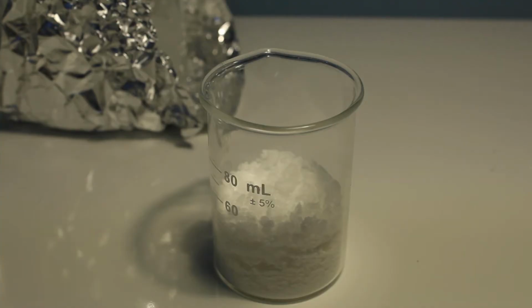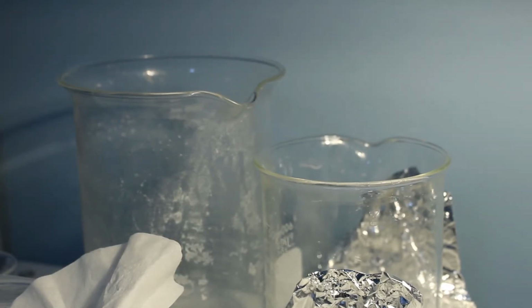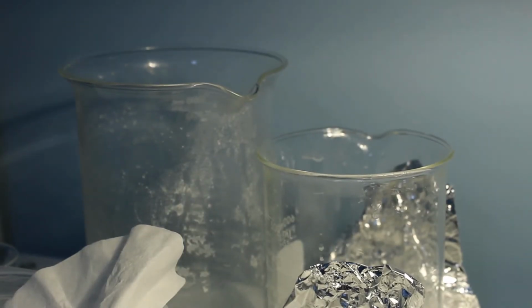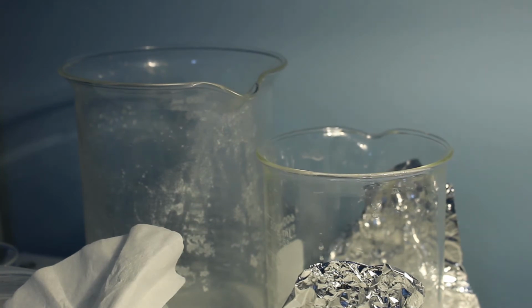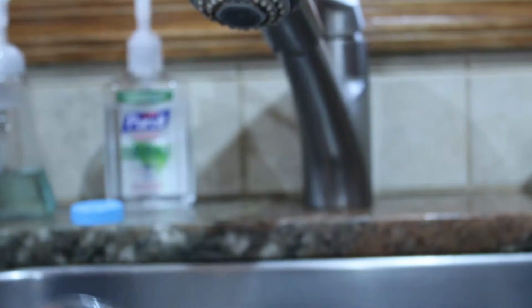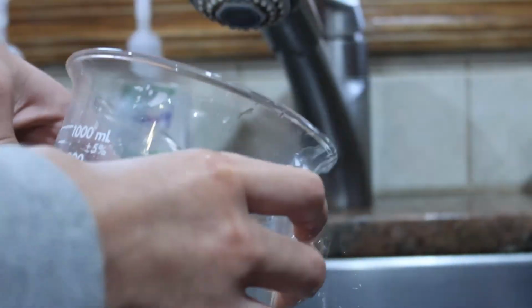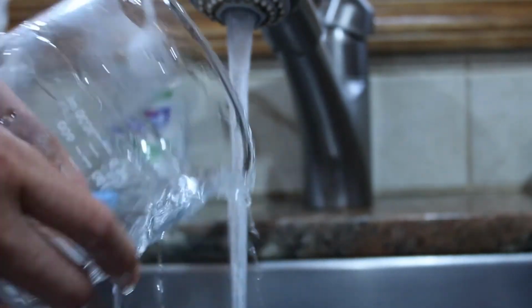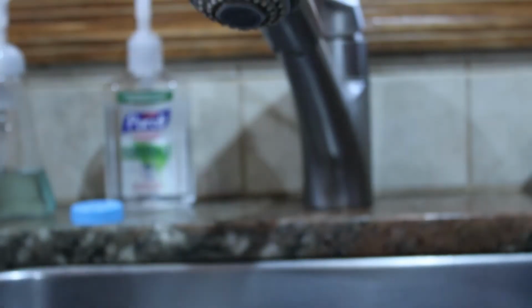Now that we're done making sodium citrate, we can move on to making the Benedict solution. Before we begin, we should address the problem of dirty beakers. Concentrated sodium citrate solution likes to stick to things, and it leaves the salt everywhere it goes. And so, you get a nice white coating of the salts on your beakers that wouldn't be a good idea to scrape off. What I recommend is the best method to do this is with a bath of hot water. You could just boil some water like you do for tea, or you could get some directly from the tap. Whatever floats your boat. All that matters is that you can get all the sodium citrate out of your beakers.